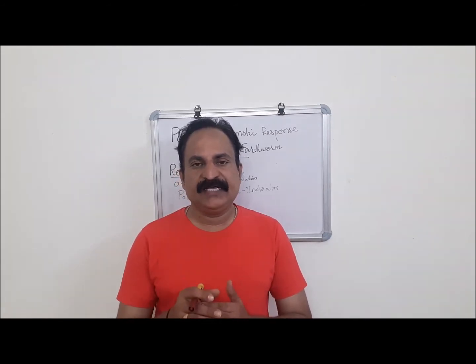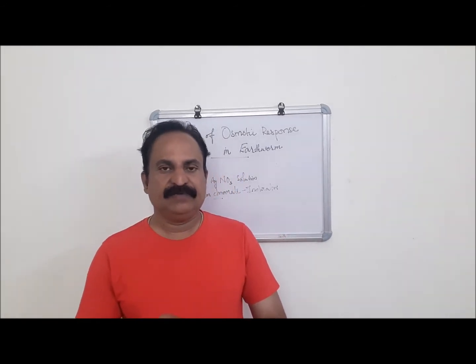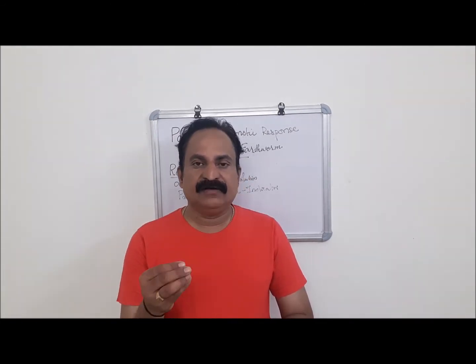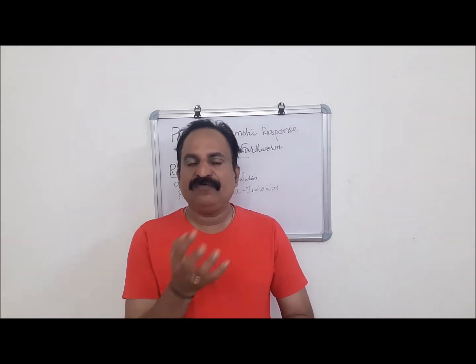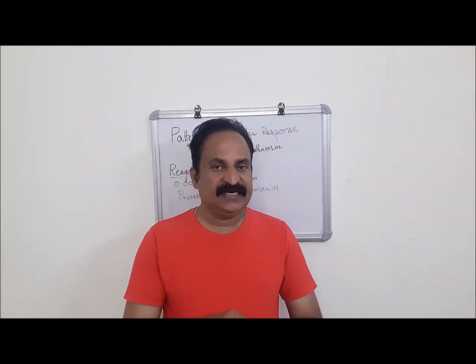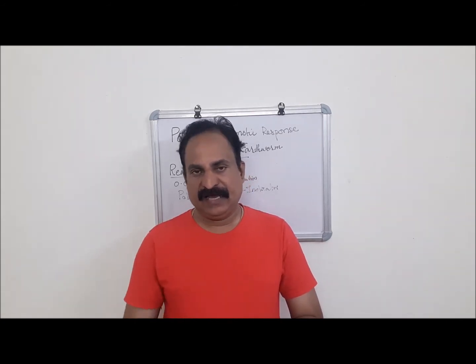These two are the media in which we are taking two sets of earthworms and separately keeping the earthworms in two different media. After 30 minutes, we are estimating the salinity of both distilled water and tap water. Before that, the initial concentration of salinity will also be estimated in both distilled water and tap water.